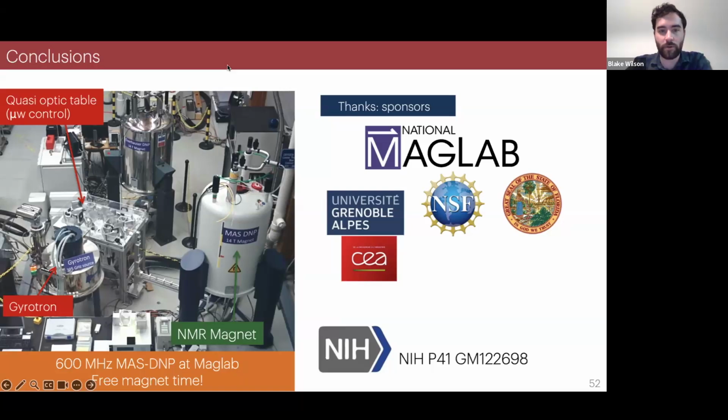Let's see. Are there any more questions? Do people have questions that they want to enter into the Q&A? I have a question from Asif. He says, DNP experiments are typically performed at high magnetic fields and under magic angle spinning, whereas EPR measurements are used at low field under static conditions. Can you comment on the importance of achieving EPR under the exact same conditions as used in DNP?